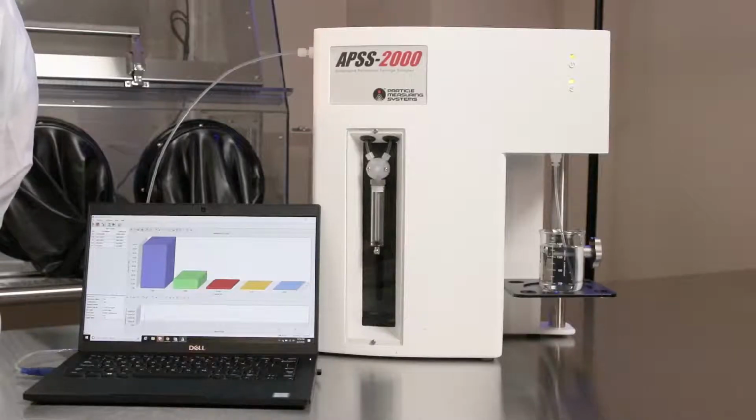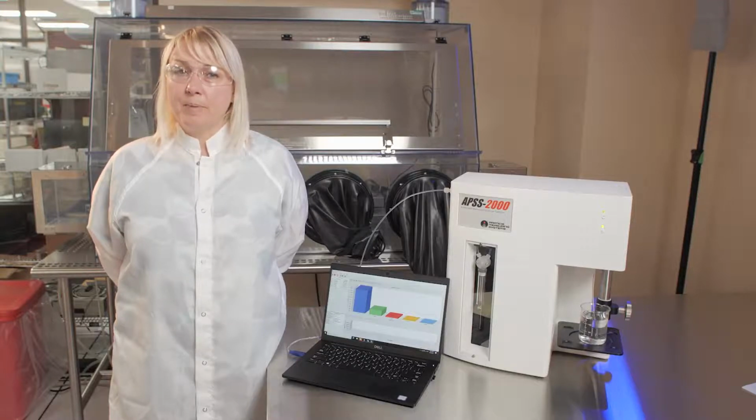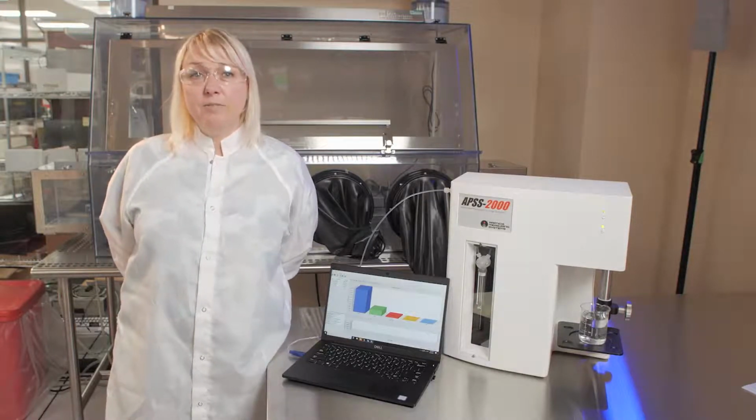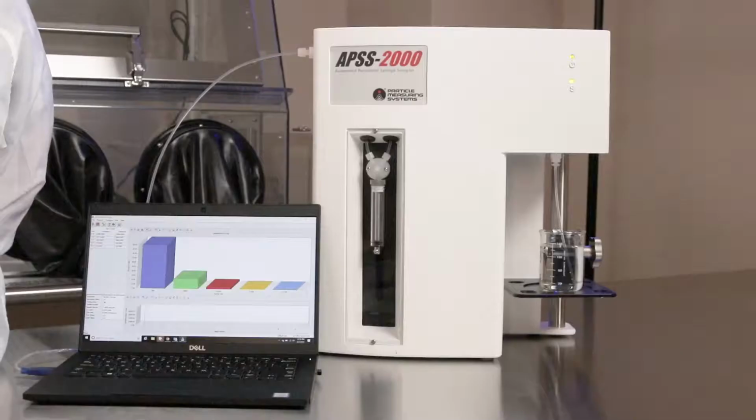USP 788 has two different methods for counting particles. There's the microscopic method. You're looking through a microscope, a technician is counting them physically, and usually this is only used when there's reduced clarity or increased viscosity in a sample.